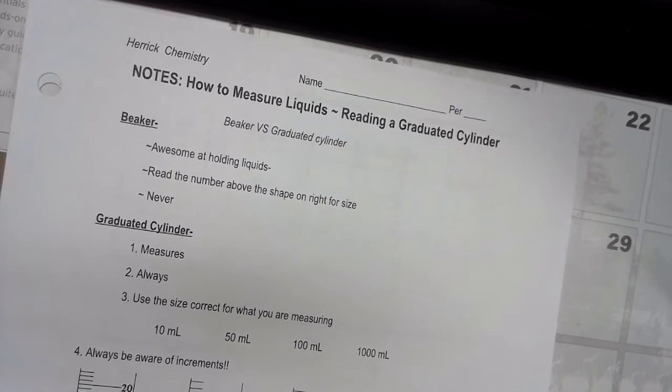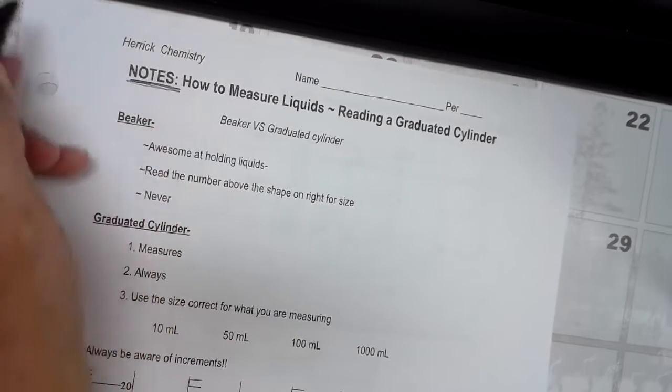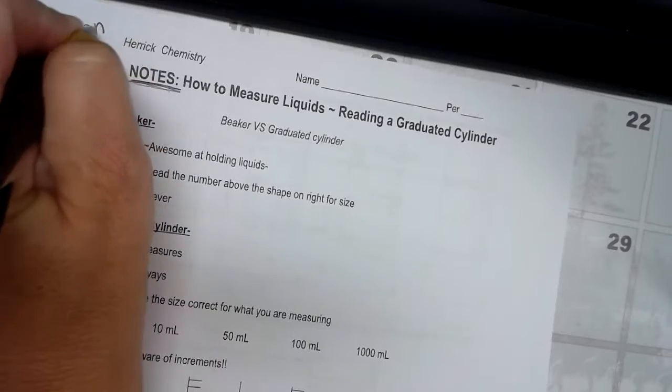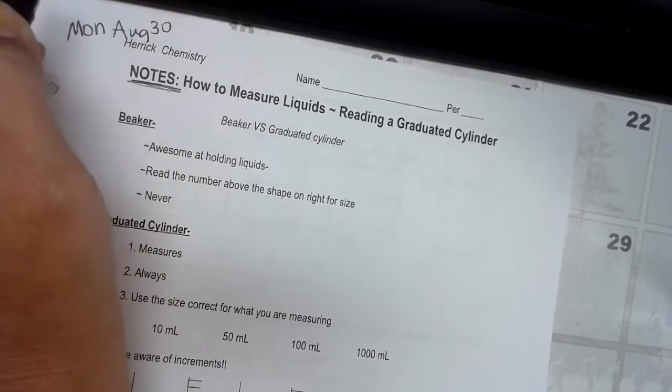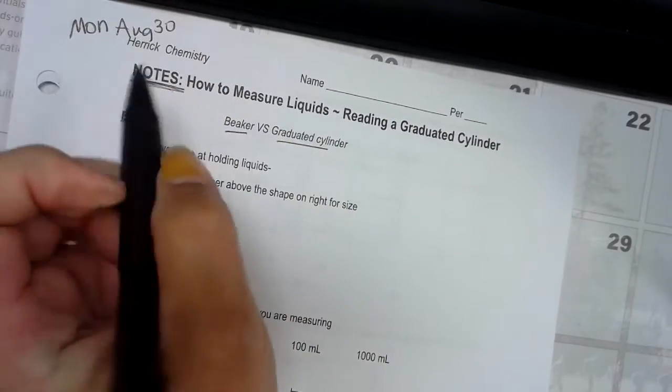Hello, chemistry students. I just wanted to talk about the notes that we covered, mostly on Monday, August 30th. We're basically looking at a beaker versus a graduated cylinder.